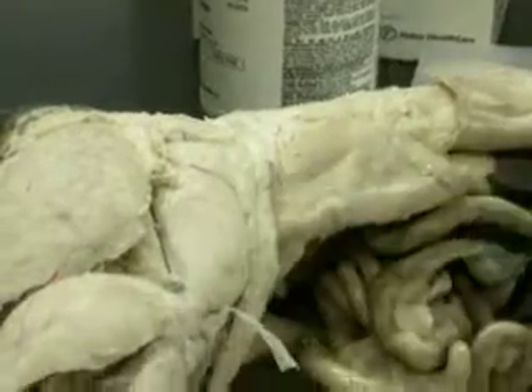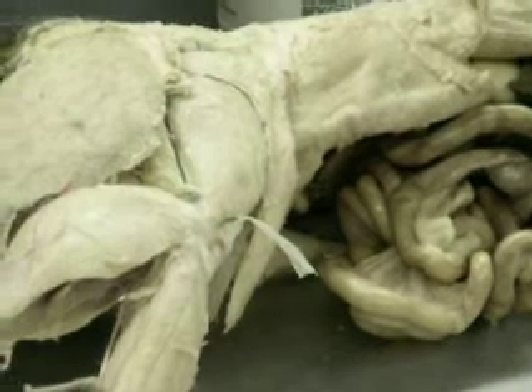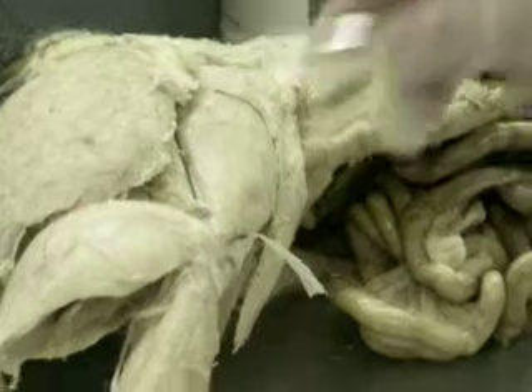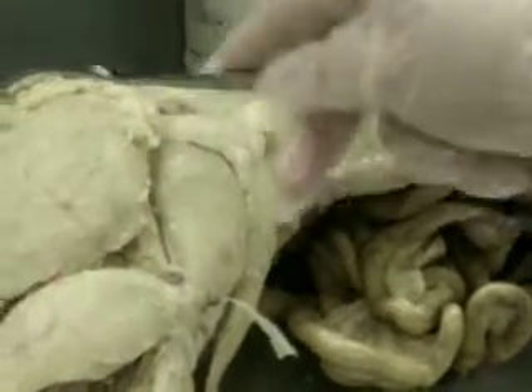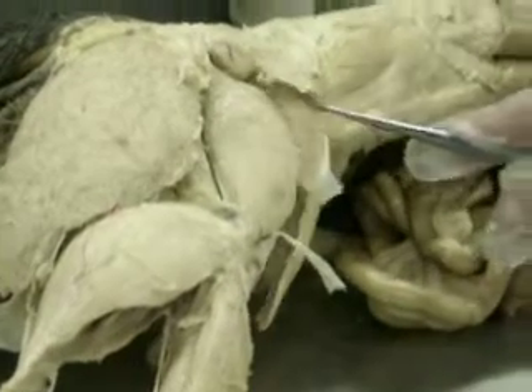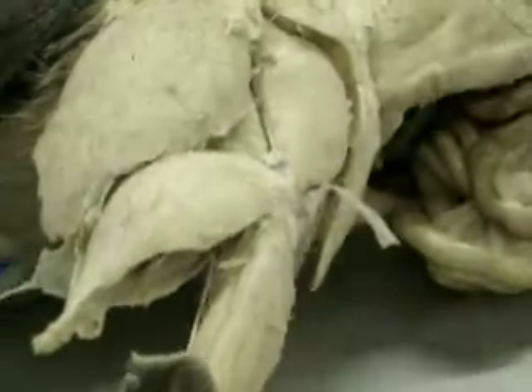It pulls on the fascia and tightens it, which helps to brace the knee and stabilize the knee. Do we have these? Yeah, we have the same muscle — we just don't have the caudofemoralis, the one that comes from the tail. So we have the gluteus medius, gluteus maximus, caudofemoralis, and the tensor fascia latae, and you'll see the fascia latae covering the side of the thigh.